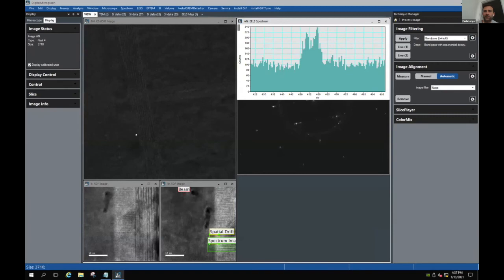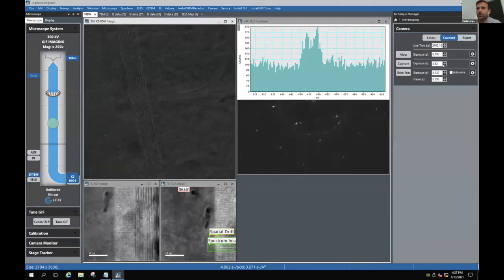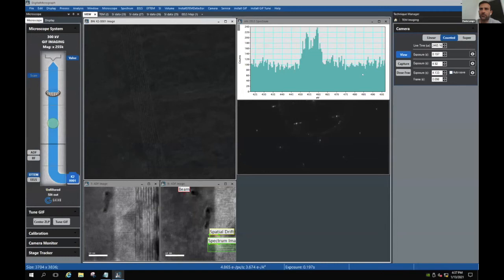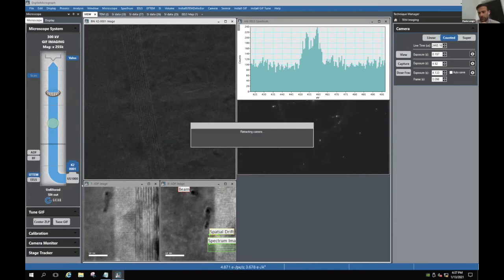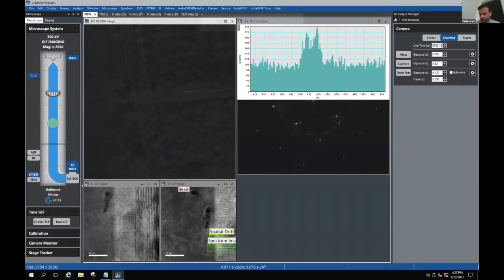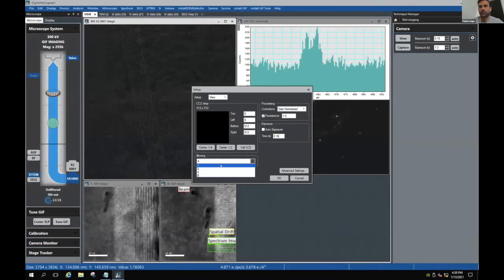Let's see, this is the image right now. So let's go back to DM imaging. Okay, this is our image. We have 5 electrons per pixel per second. So let's stop this one and now let's try to see the same thing with the other detector. Let's look at the difference now. Pascal? Make sure that we have binning one, so it's apples to apples at least.